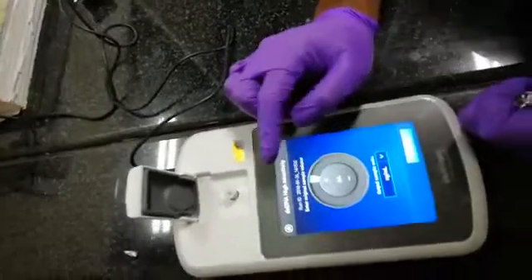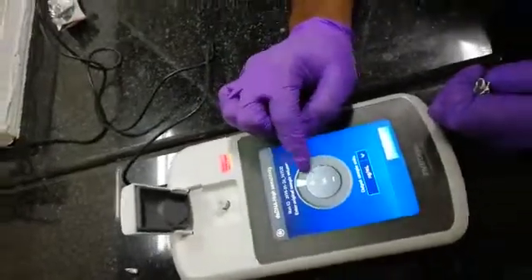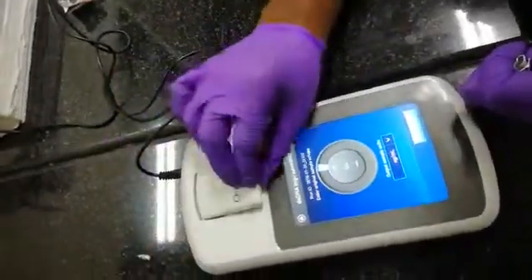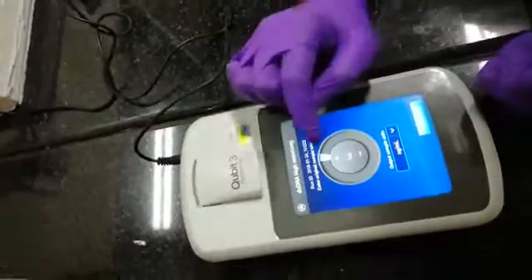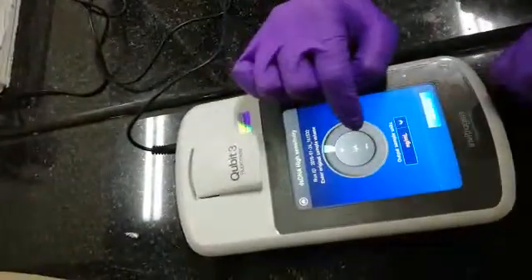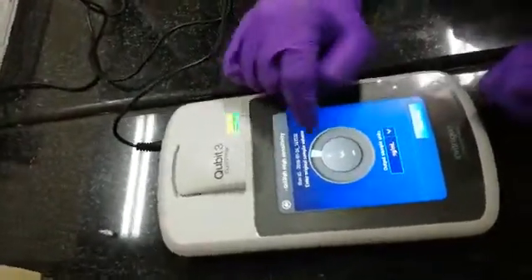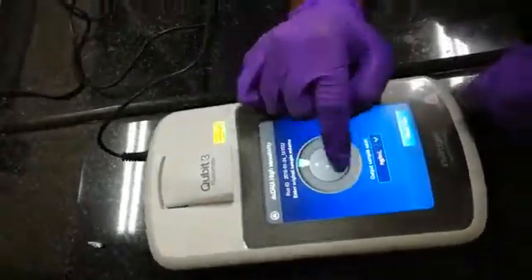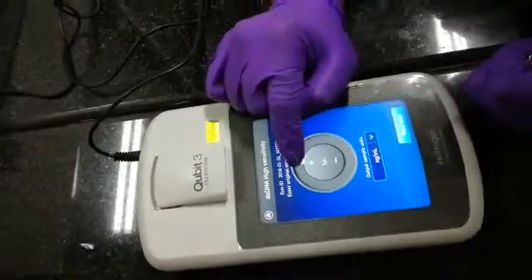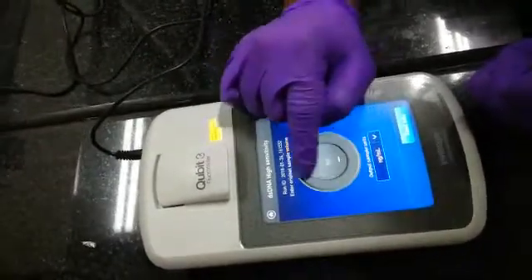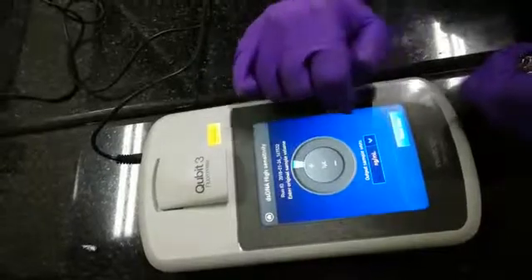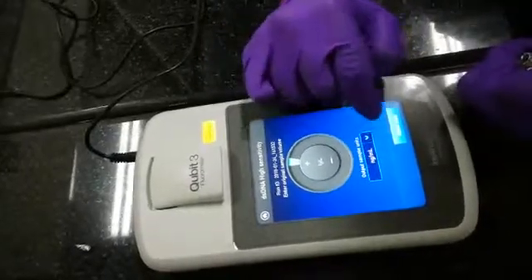The volume of your sample is one microliter. The general volume range for the Qubit fluorometer is one to twenty microliters — you can load one to twenty microliters of your sample. We have generally loaded one microliter of sample.